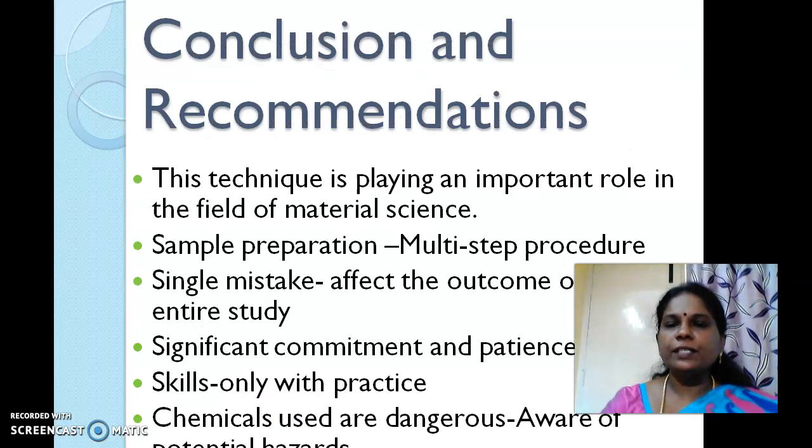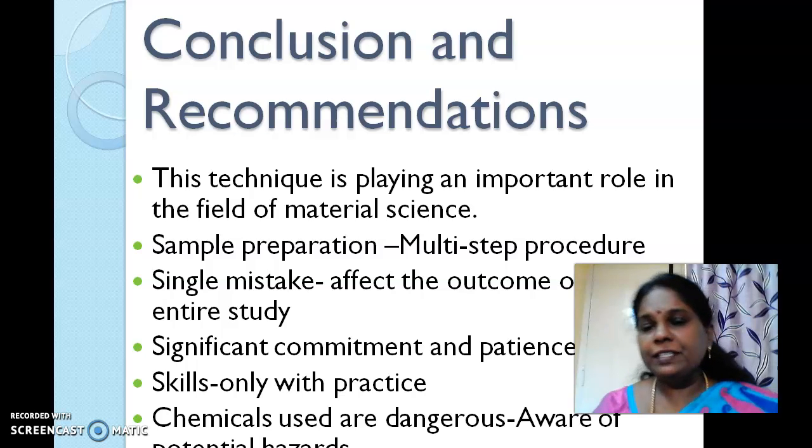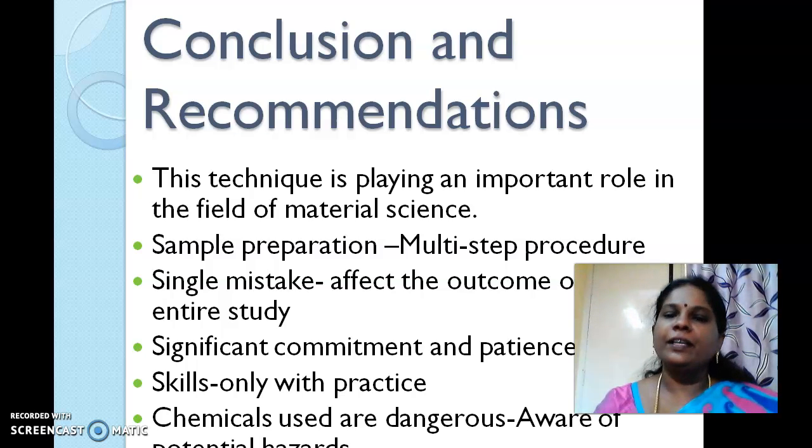Even with these disadvantages, TEM is an important characterization technique which is playing an important role in the field of material science. The only difficulty is the sample preparation, which involves a multi-step procedure.